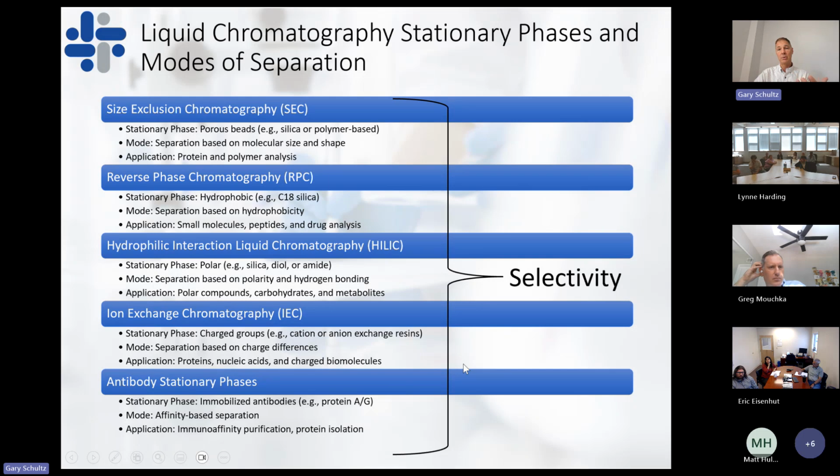So essentially, in order to have a targeted extraction of analytes of interest from your matrix, you combine one of these different modes at the wet bench, and then in combination with an orthogonal method of separation with the LCMS. Sometimes you need to do affinity capture at the protein level, like we did with the beads, and then combine that with affinity at the peptide level, and also with two different reverse phase modalities.